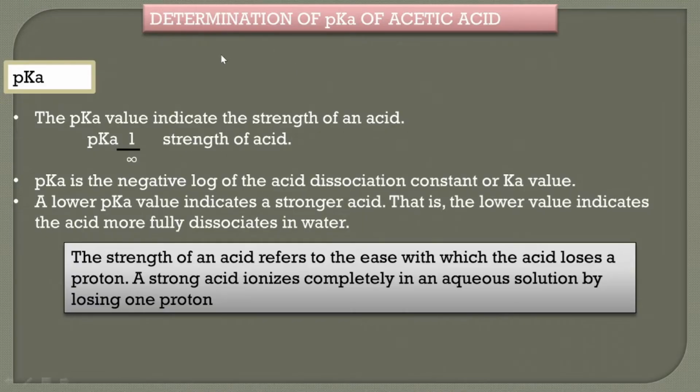Good morning, dear students. Today we are going to see the practical to determine the pKa of acetic acid. First, we need to understand what pKa is.